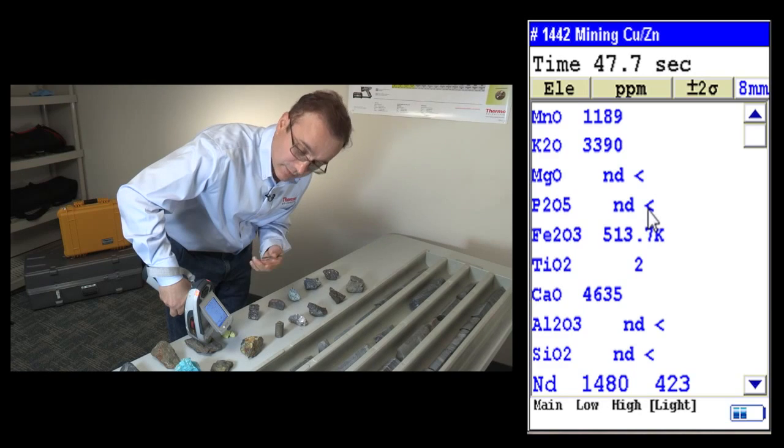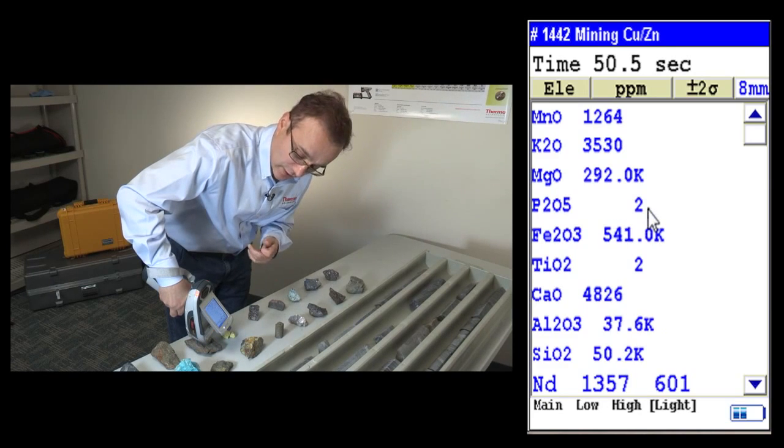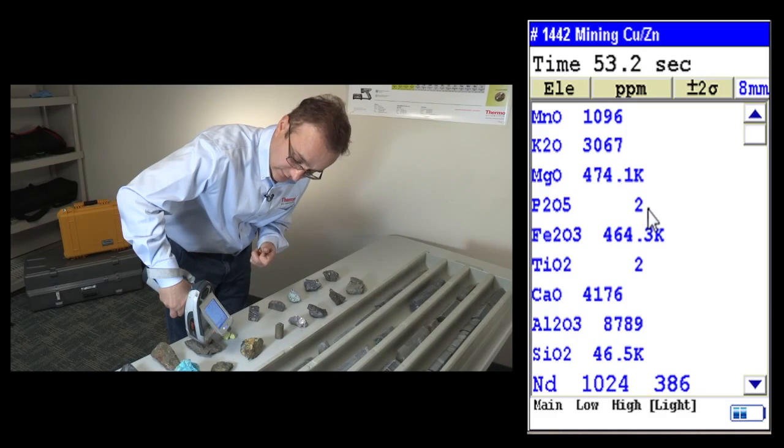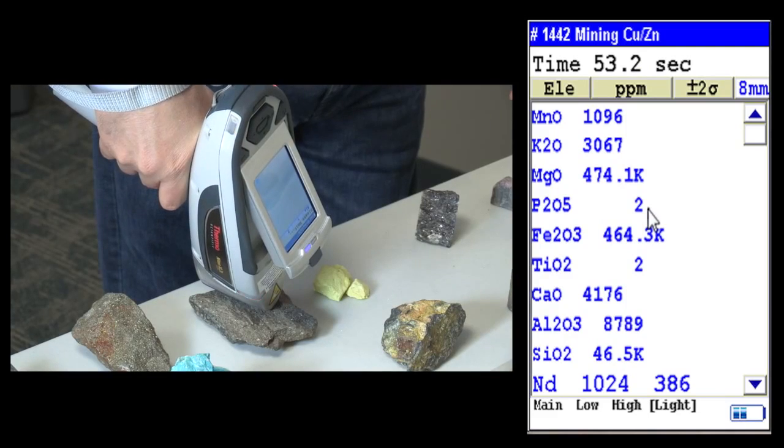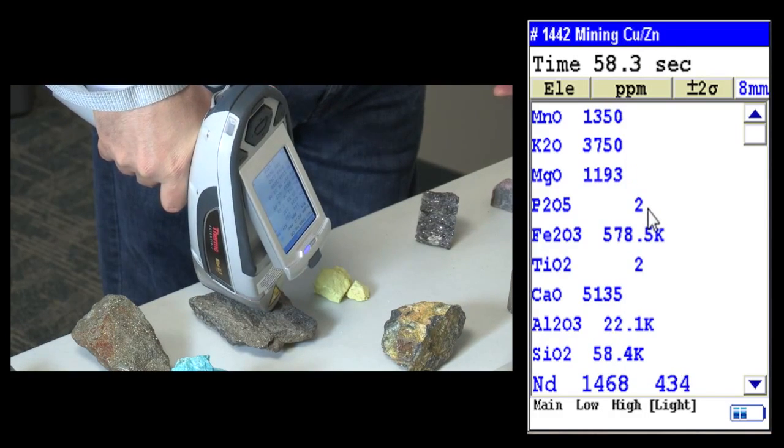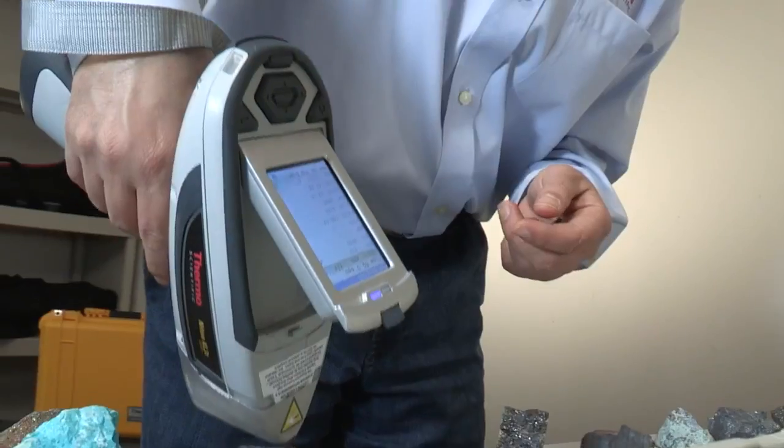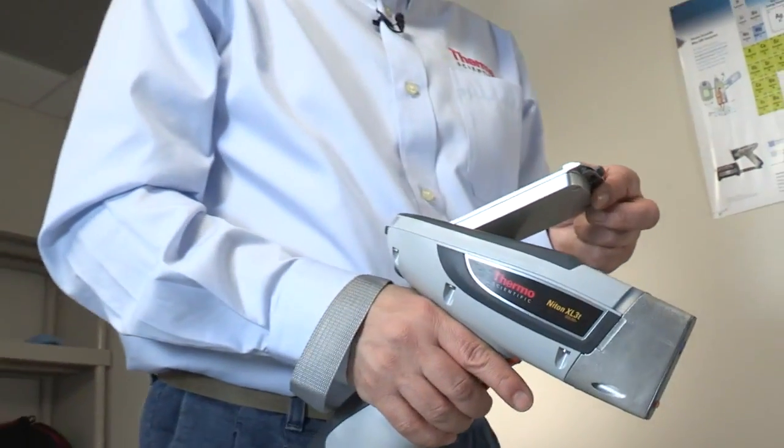You hear a beep after a certain time that you can adjust. In 60 seconds, the analysis will stop and then we can view our results. Now, the 60 seconds is done.